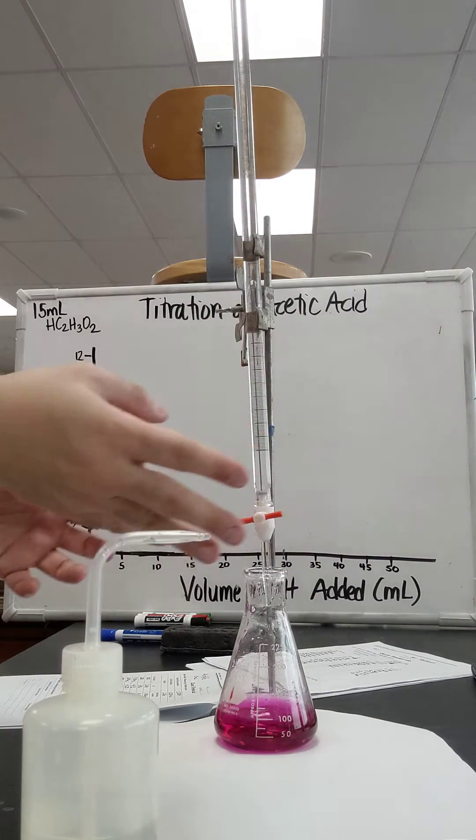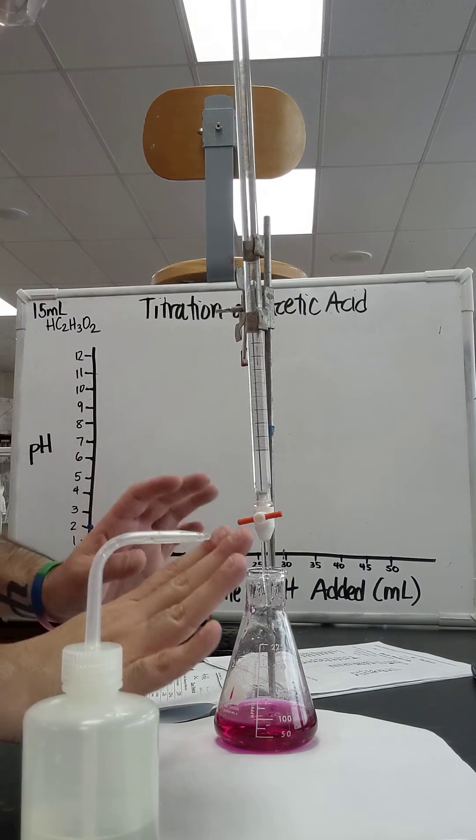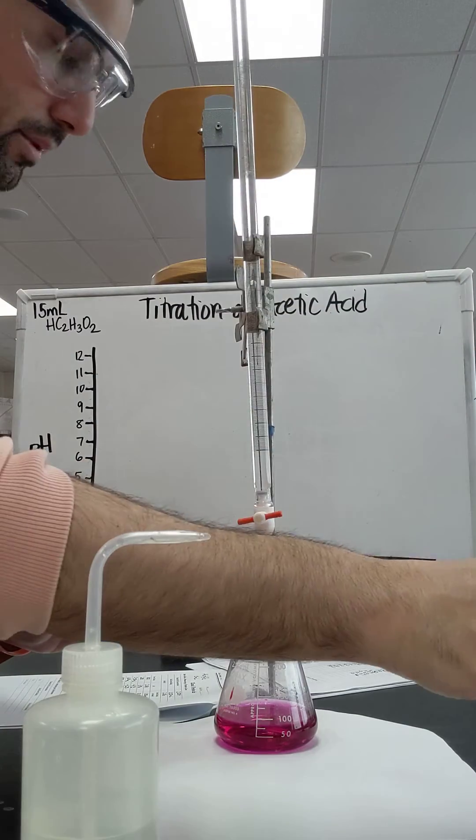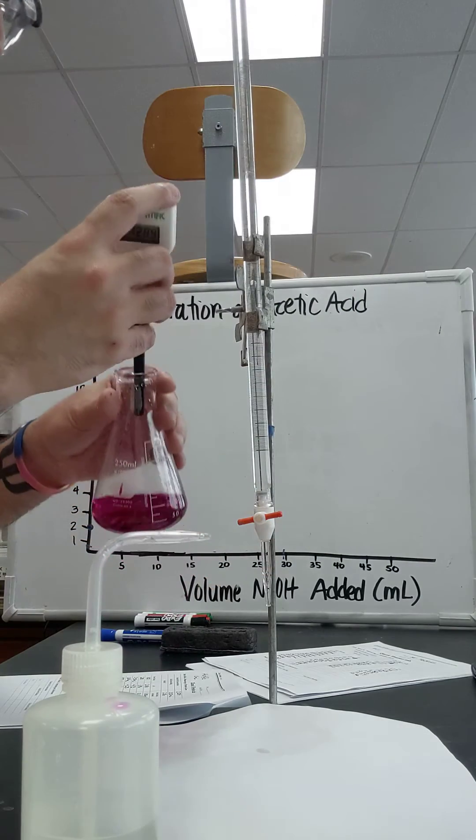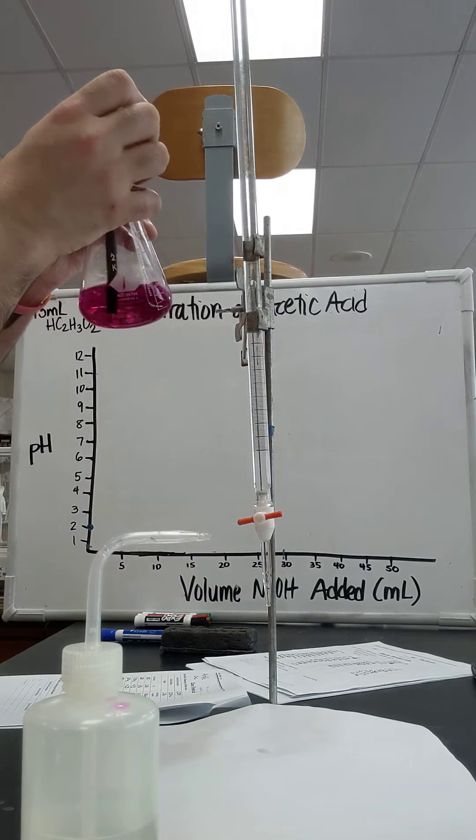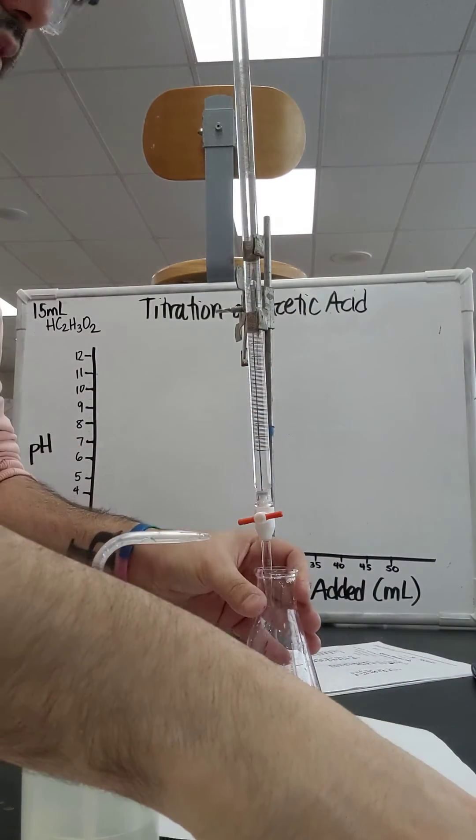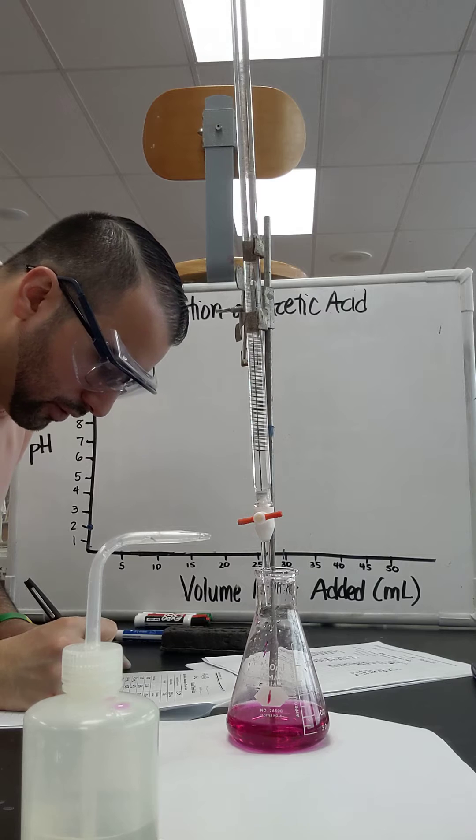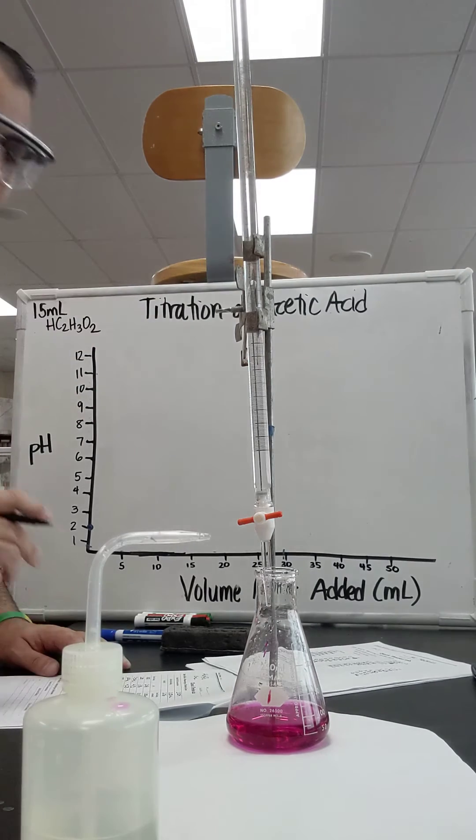By the way, this is way past the end point, but we're still getting this data. That means all of the acid is gone by now. If there was still acid in there, it'd be a bit colorless like this. But there's no acid in here, I have all base. And how do I know that I have mostly or all base? The pH is really high. pH is greater than 7, so it's mostly basic. And so now I have 12.84. So I'm going to say I'm done recording measurements up to 15 milliliters, and it went to 12.84.